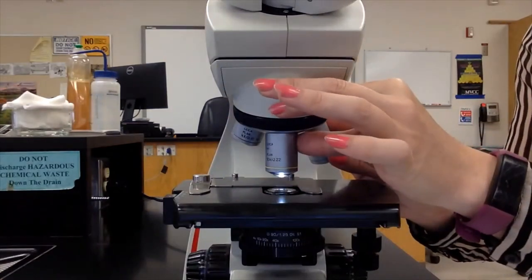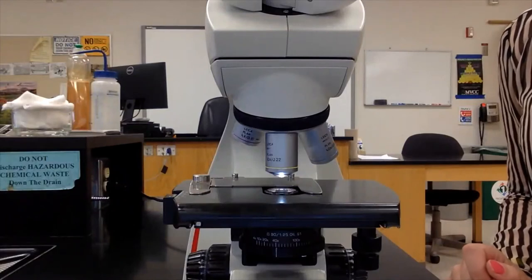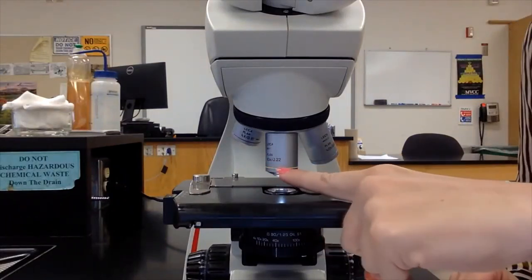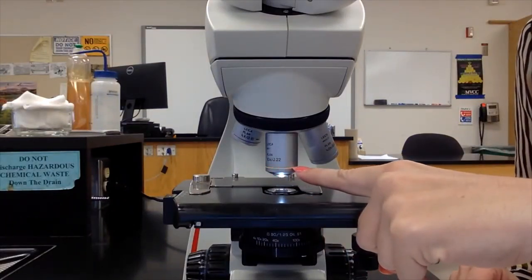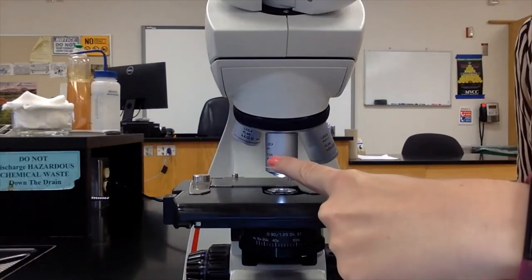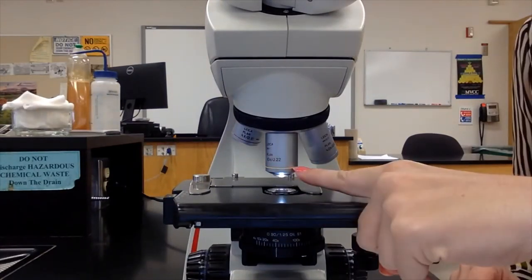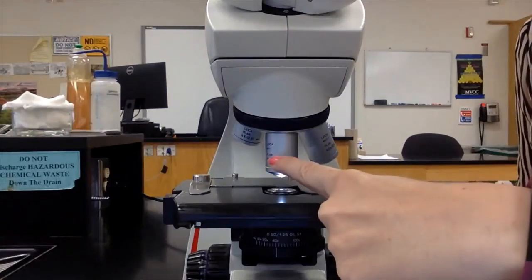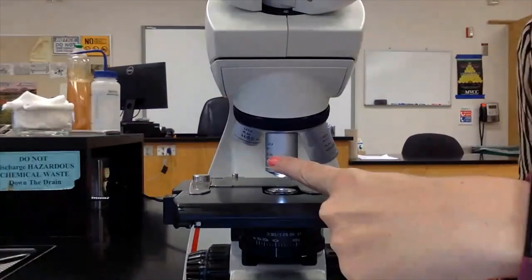Taking a look at this lens, it has a yellow band and says 10 times magnification. So how many times total magnification are you viewing your object at? Take a second and pause the video and see if you come up with the right answer.